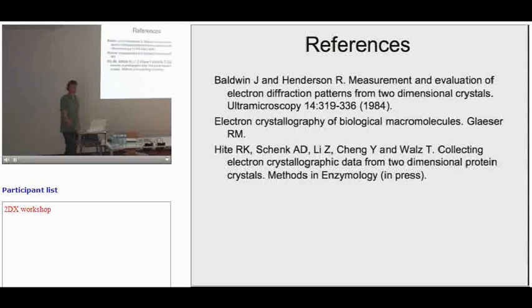Typically, in my session, how many crystals do you get? It's entirely variable. I can go for a week without getting any, and then in a single day I've gotten, I think the most is close to 100. So if I get a good sample, it's great. If I don't get a good sample, it's just keep switching until I do.